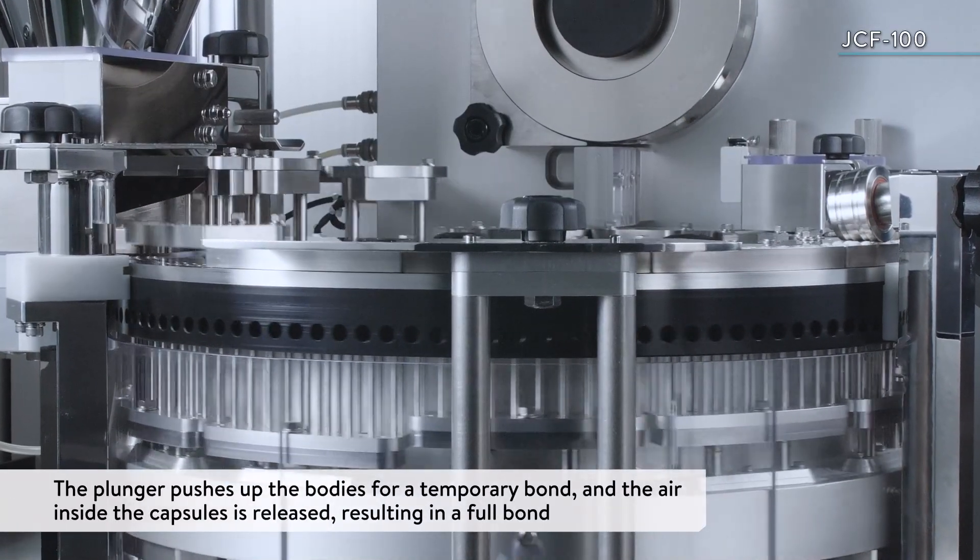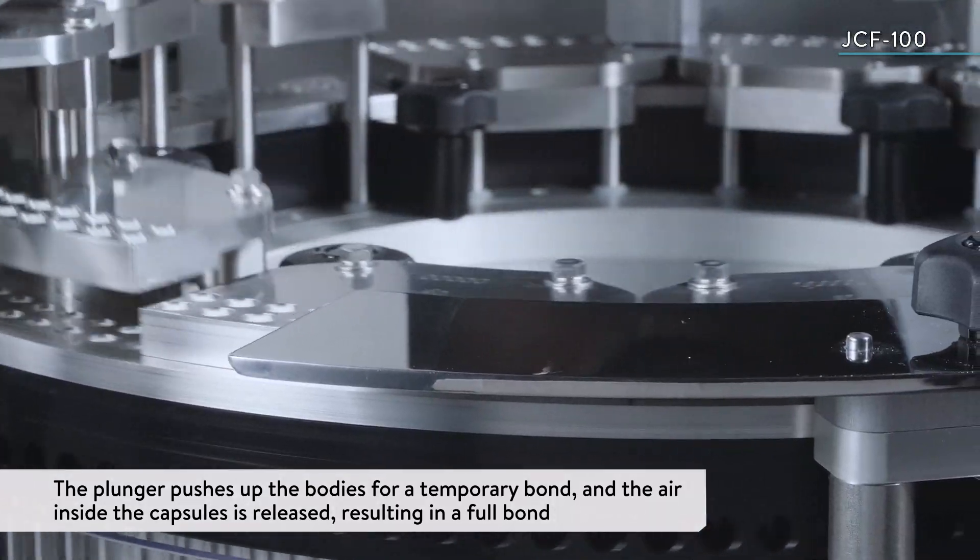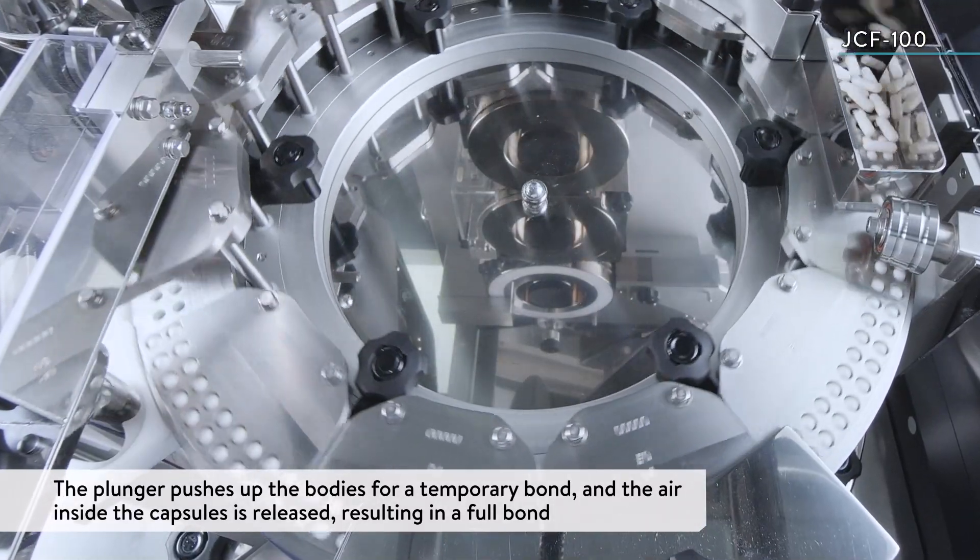A plunger pushes the filled bodies up for a temporary bond and the air inside the capsules is released, resulting in a full bond.